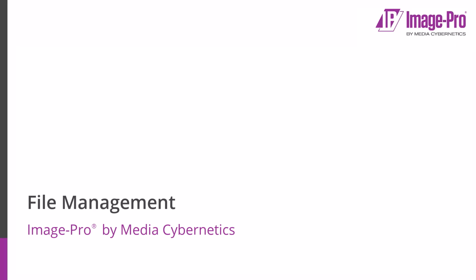In this video I'm going to demonstrate file management in Image Pro. The Image Pro File Management view provides flexible and easy to use options for opening files, saving files, creating new files, and importing multidimensional datasets from folders of individual files.